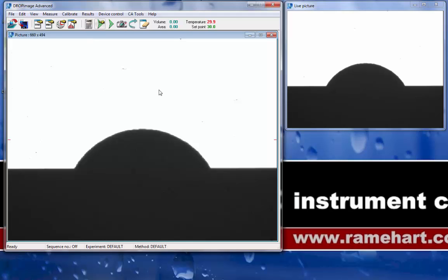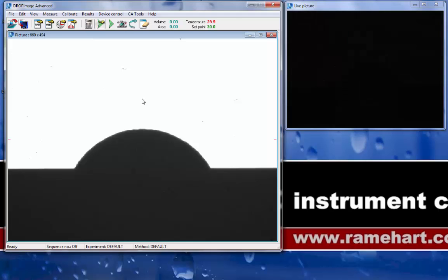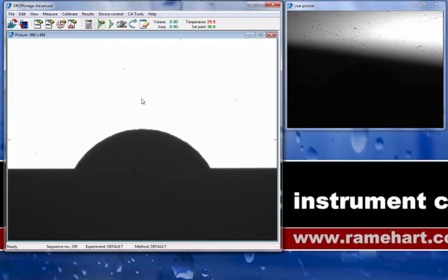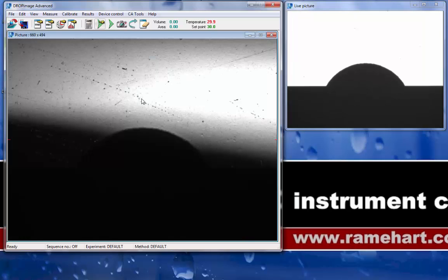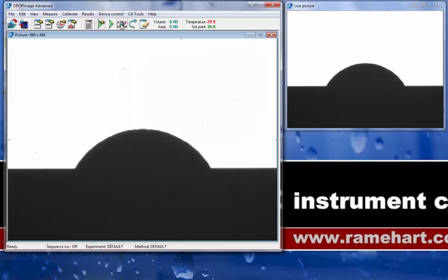In order to capture a picture from the live video, I can either hit Ctrl-T on the keyboard, or I can come up to the toolbar and click on the camera icon for Take a Picture.